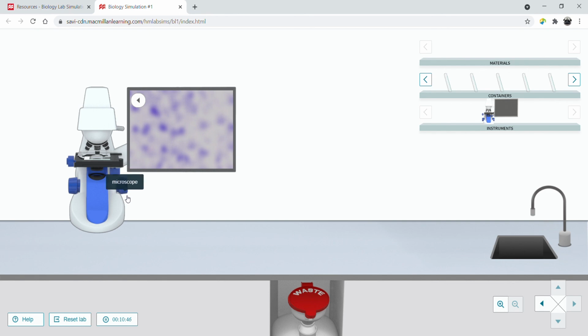So what the question asks you, of the 3 different categories of shapes, remember those? Spirochetes, that's the one. What are the other ones? Cocci, and what's the other one? You have to determine in figure 4 what shape those bacterial cells are. All right, so fill that out. That's number 4 here on part 4, bacteria. And then submit that to the submission link for this week's lab points.